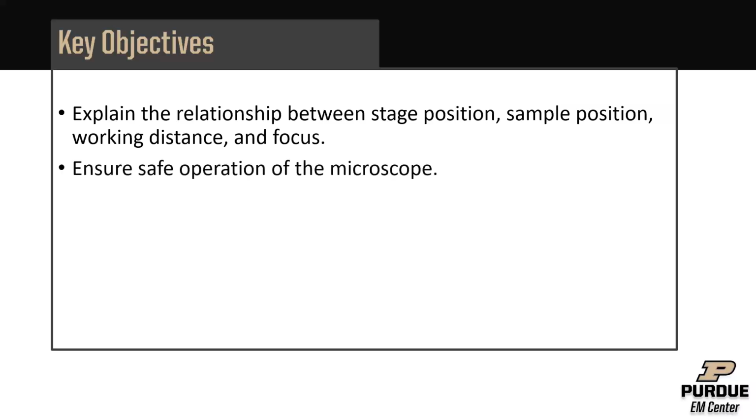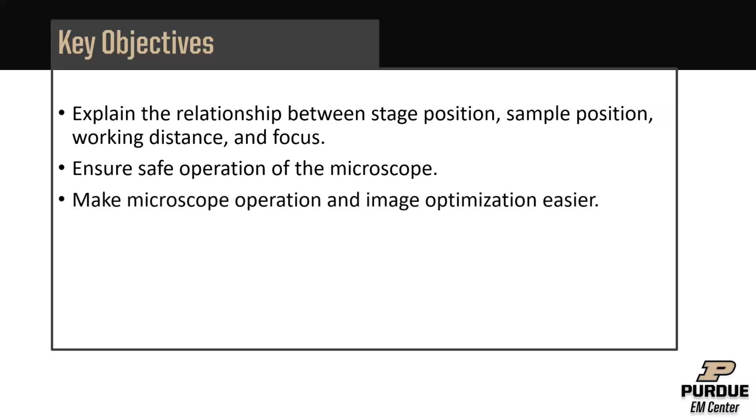And our main goal here is not only to ensure safe operation of the microscope, but also to make microscope operation and image optimization easier for the users.